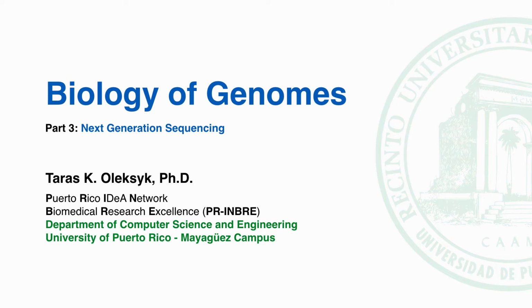The revolution in genomics is riding on the rapid development of next-generation sequencing technologies. In this lecture, we'll introduce the principles behind some of these approaches. At the end of this lecture, you should be able to mention the main advantages and disadvantages of the next-generation sequencing methods.